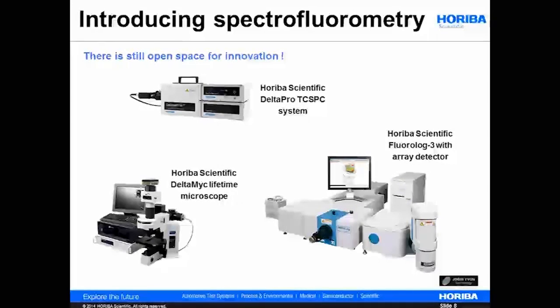The samples are no longer ideal samples. They present very high or very low concentration, which means the system must be able to fight against sensitivity limits or against saturation of the detectors. You need to be able to correct for inner filter effects linked to the sample. You need to be able to filter interference of other compounds. And in this respect, array detectors and CCDs are the tool of choice.